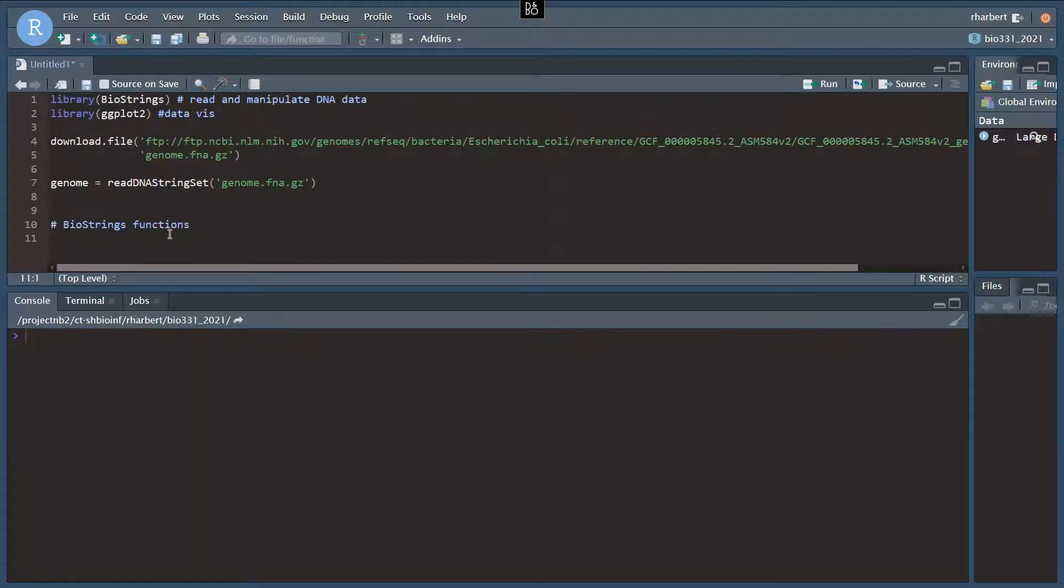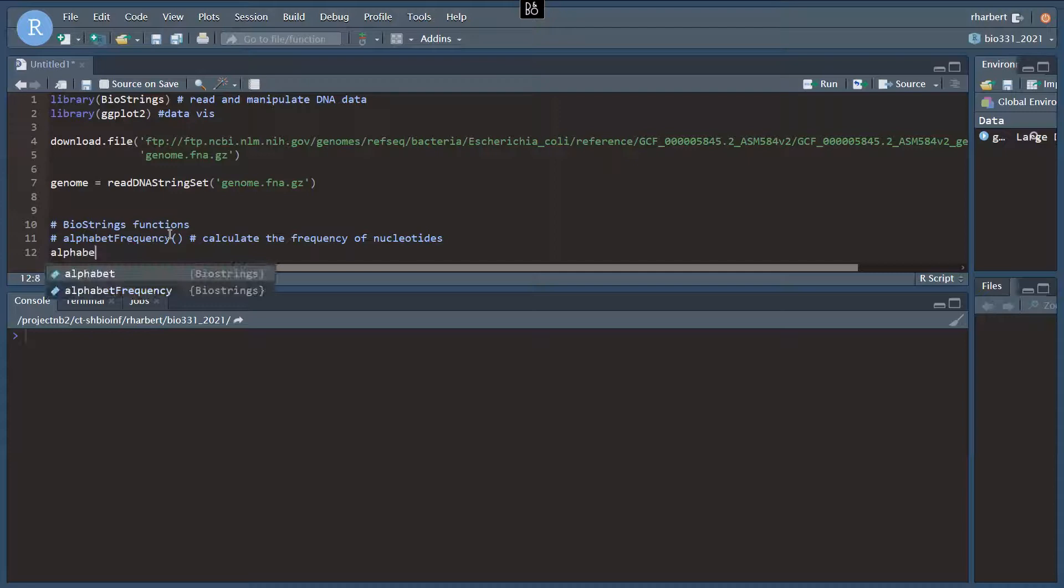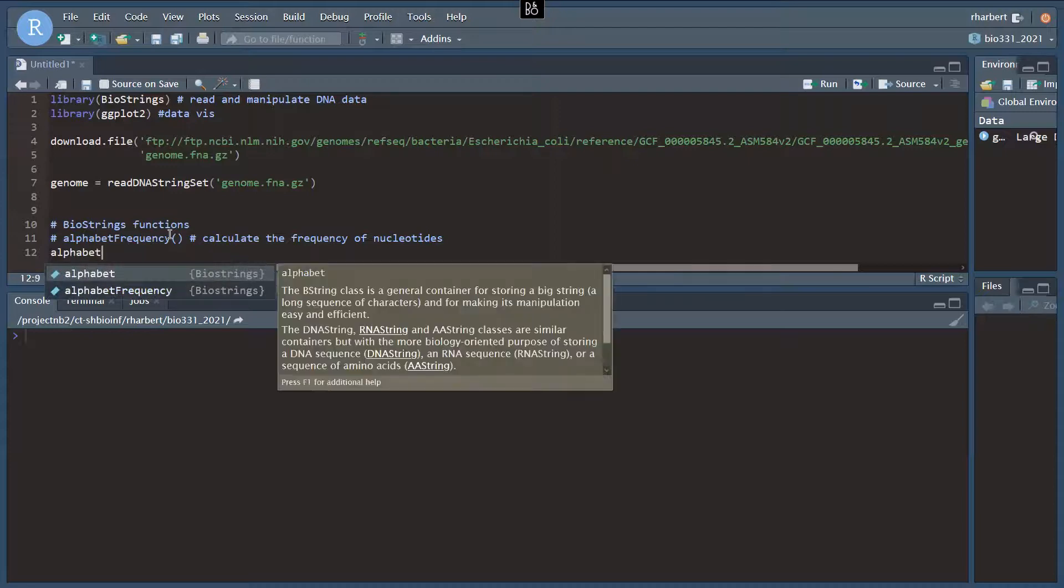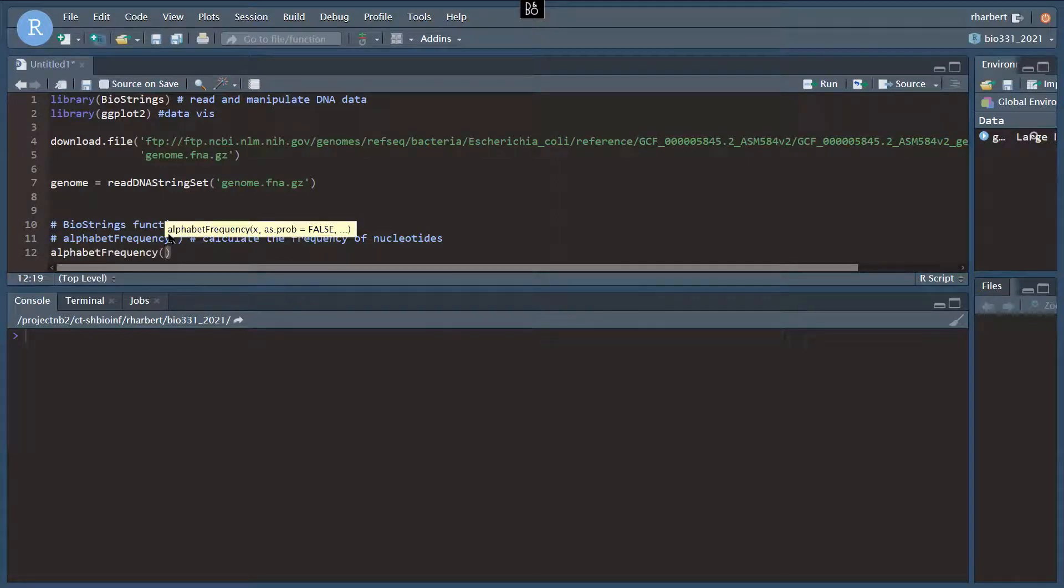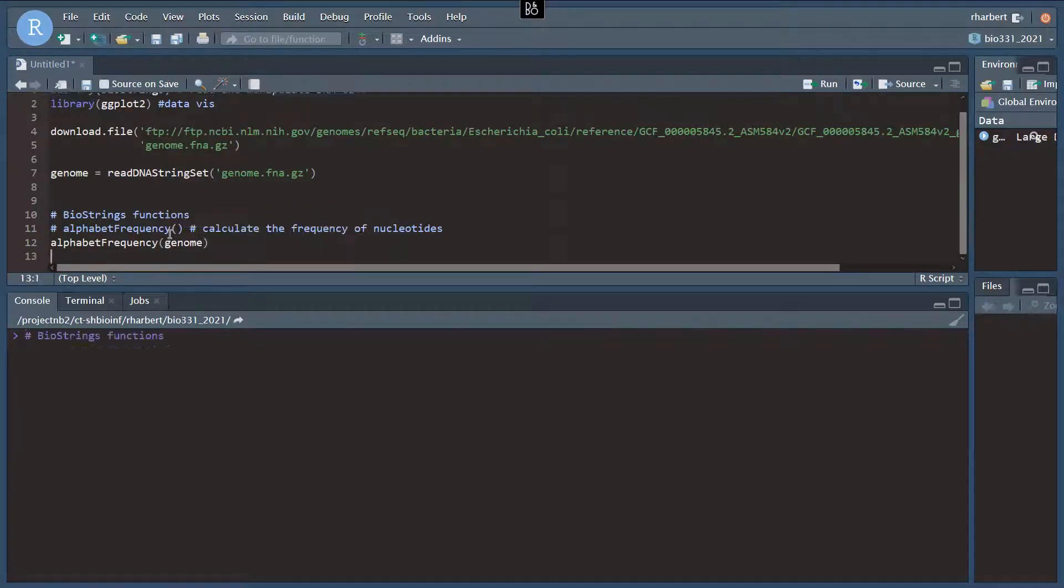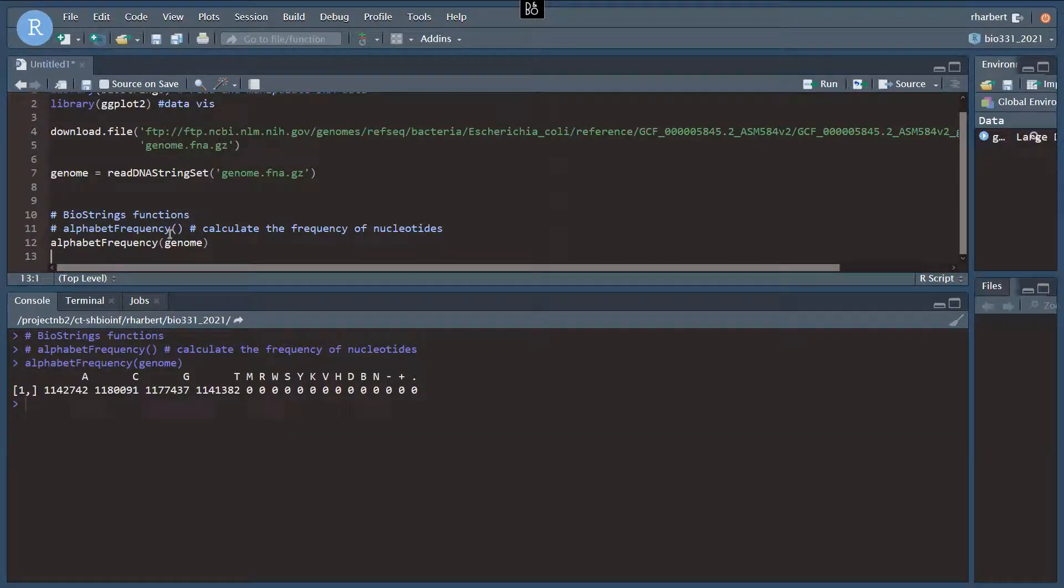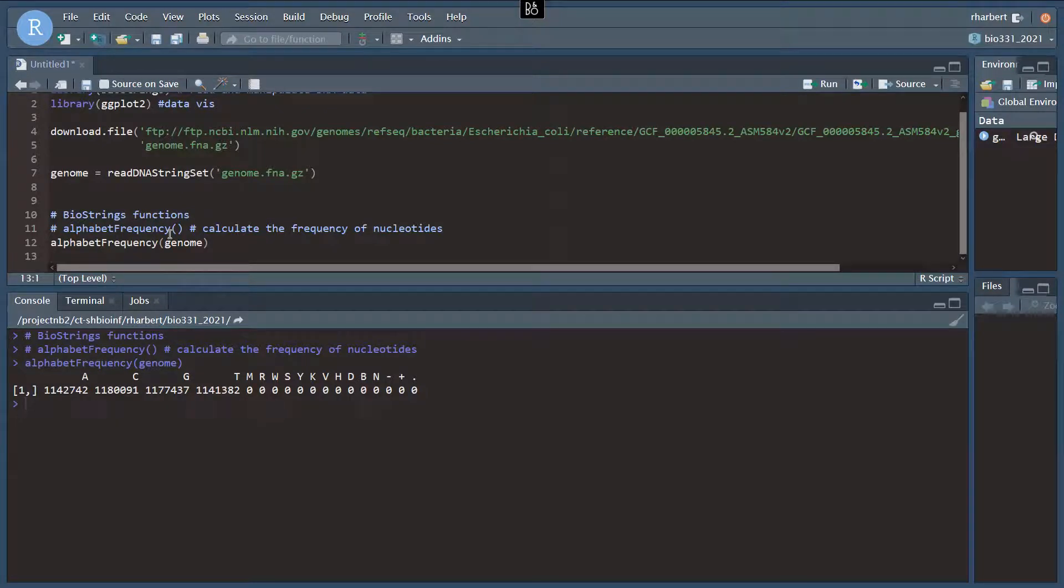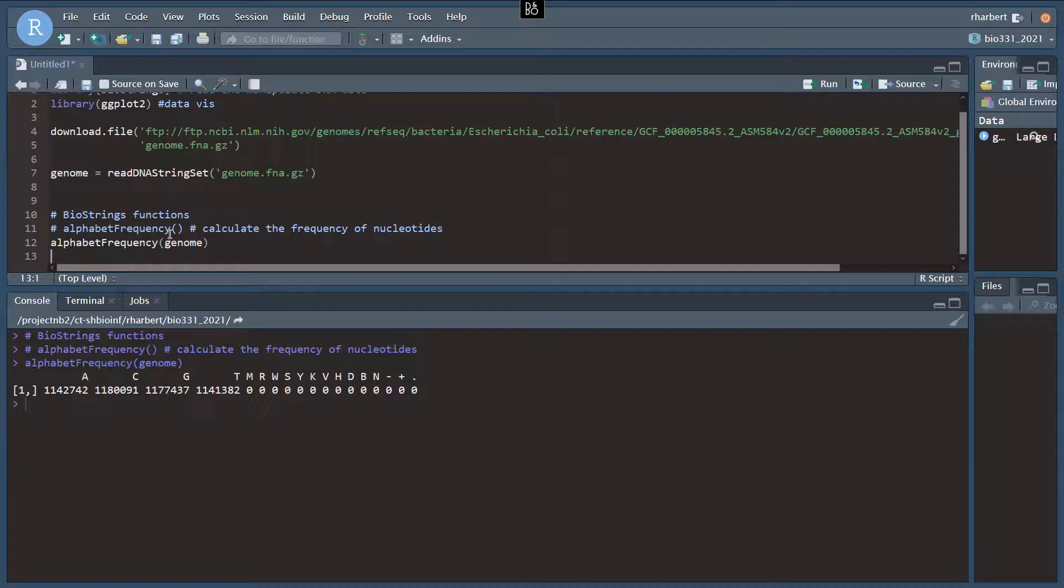The first one is called alphabet frequency. And this is going to calculate the frequency of nucleotides in the sequence. So let's try this out. Alphabet frequency of the genome object. And let's just run that. Okay. So 1.14 million A's, 1.18 million C's. None of the alternate codings, MRW, or insertions, or deletions.